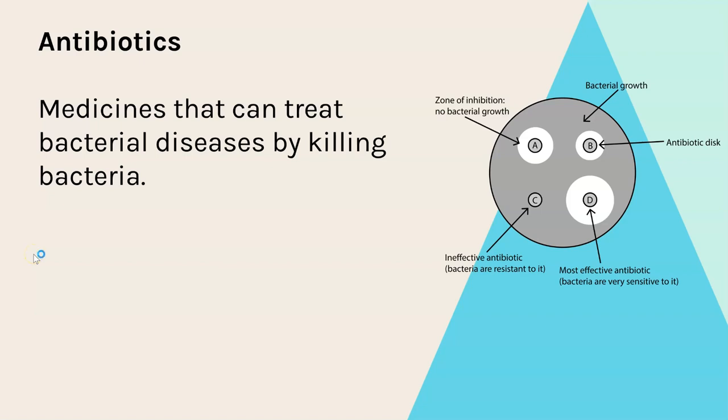Now in this investigation we're going to be looking at which antibiotic, or you might be using other antimicrobials, is the most effective at killing a particular bacteria. So just a reminder that antibiotics are medicines that can treat bacterial diseases by killing the bacteria.